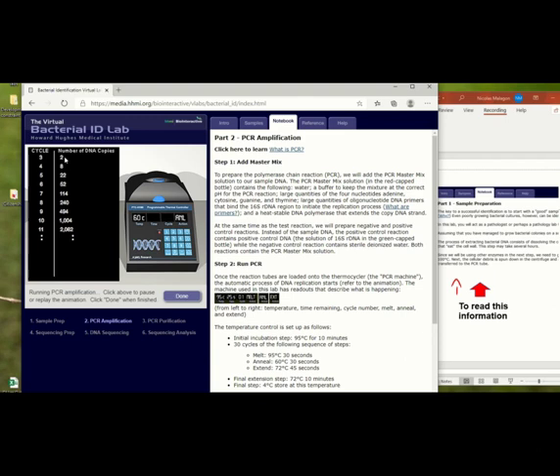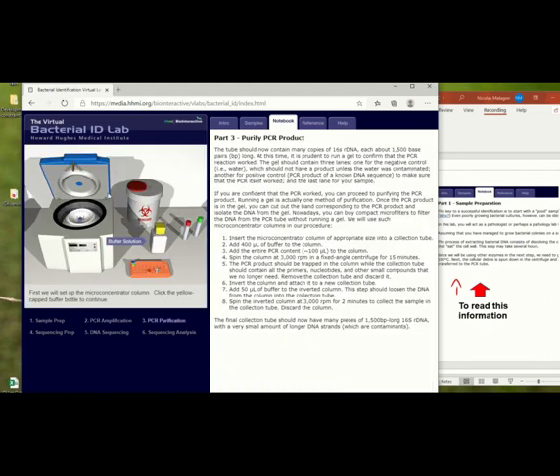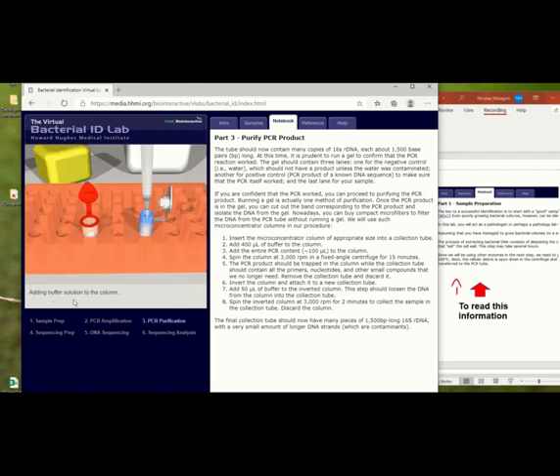So now they're showing how many copies you're getting. So look, I start with 2, then I move to 8, and now I have millions and millions of copies. And now I can move to the next section, and here now I have to click on the orange tray and go to the PCR purification. Here you have to read this, and I have to click on the buffer solution, and this will pipette again, and we're going to add the buffer solution.